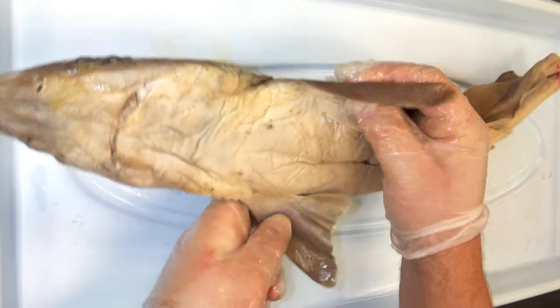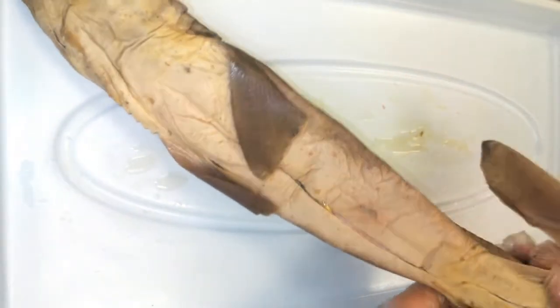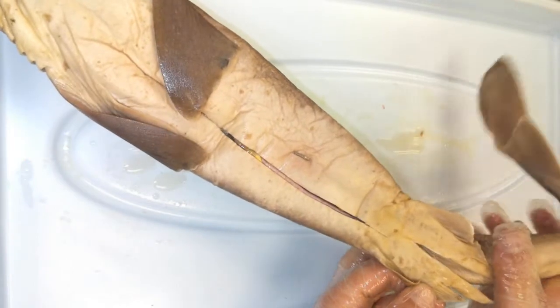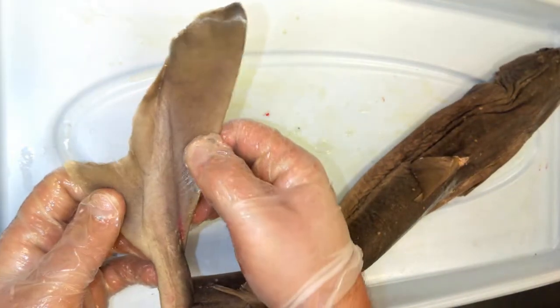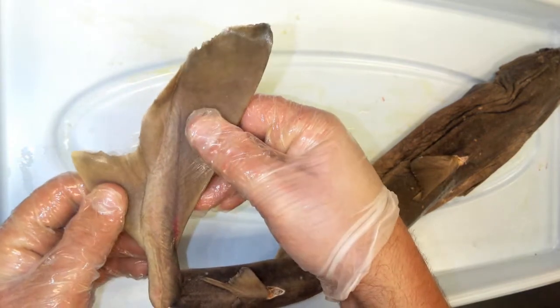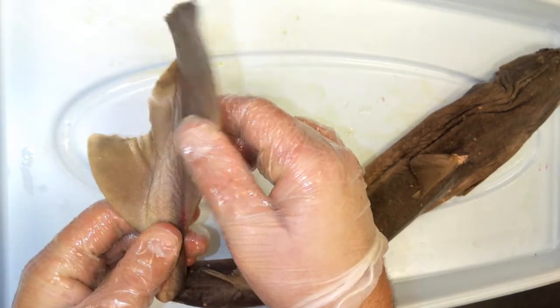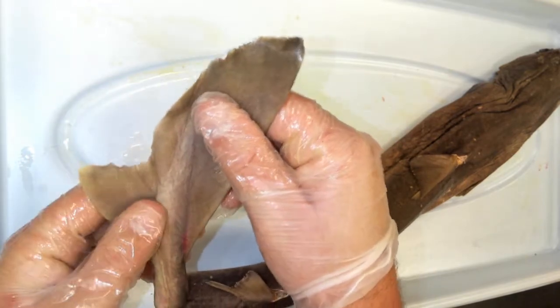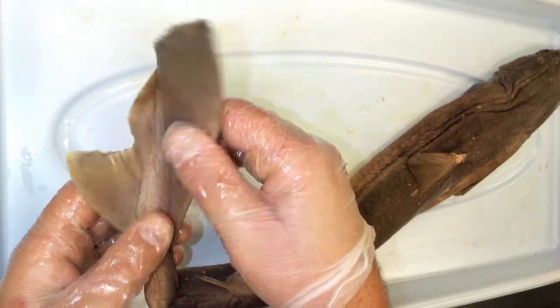It also has two pectoral fins and two pelvic fins, and then of course its caudal fin, or tail fin. In common with other sharks, this tail fin is known as a heterocercal tail fin, which means it's made up of two asymmetrical lobes — a bigger lobe and a smaller lobe — and this tail design helps it swim fast.